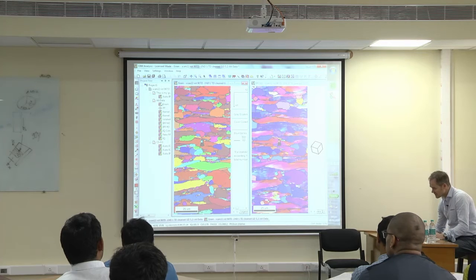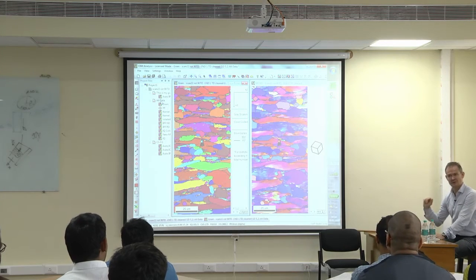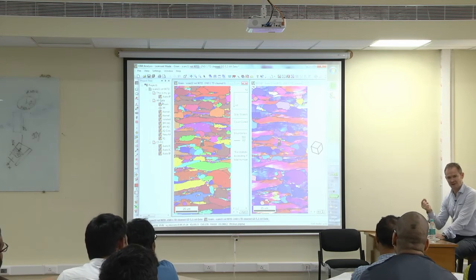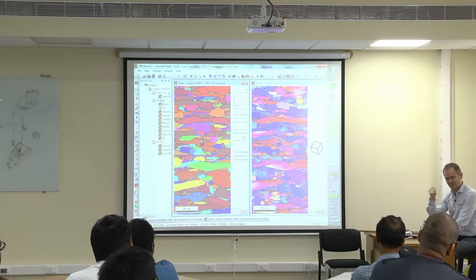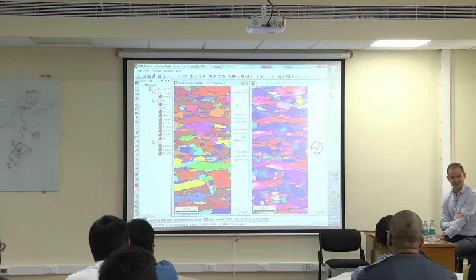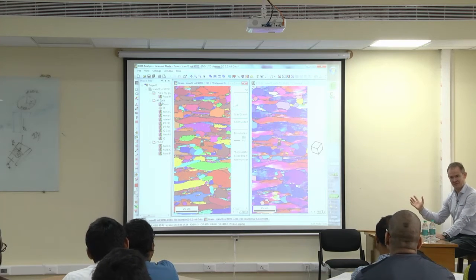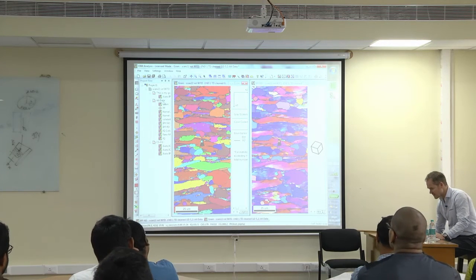So I hope you get already the power of this stupid software. Why do I say stupid and power at the same time? Power means it's enormously powerful, but stupid means it requests you to make the right decision. It does not tell you the grain boundaries are like that or so. You need to have material science knowledge in it to understand that.